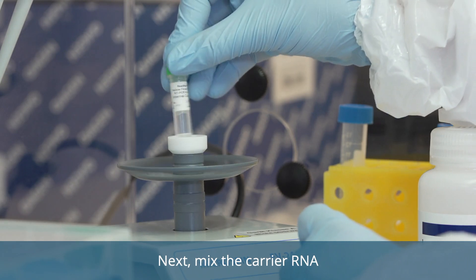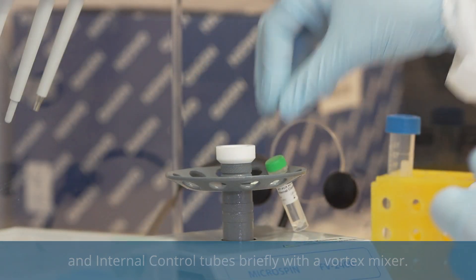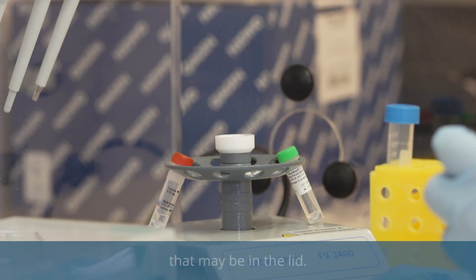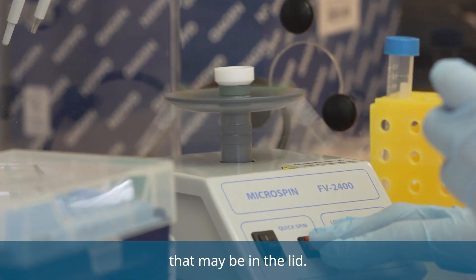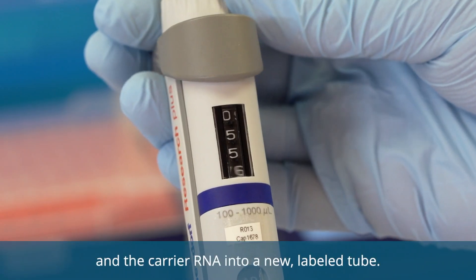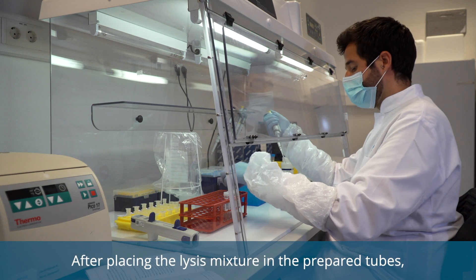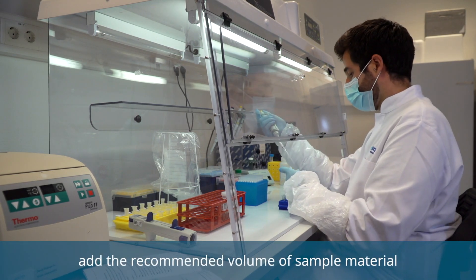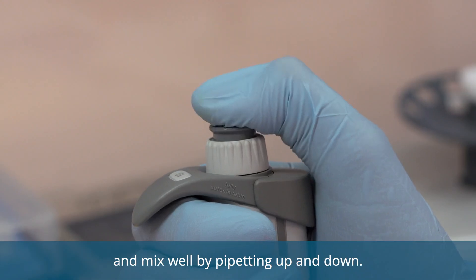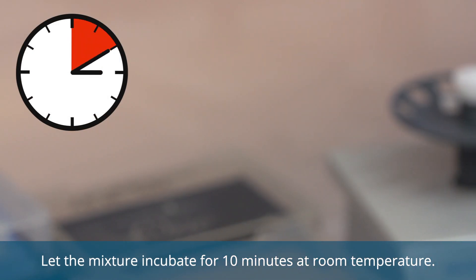Wear your lab coat and safety gloves, and work in a safety cabinet. Next, mix the carrier RNA and internal control tubes briefly with a vortex mixer. Then spin them down to avoid spilling any drops of liquid that may be in the lid. Pipet the lysis buffer, the RealSTAR internal control, and the carrier RNA into a new labeled tube. After placing the lysis mixture in the prepared tubes, add the recommended volume of sample material and mix well by pipetting up and down. Let the mixture incubate for 10 minutes at room temperature.